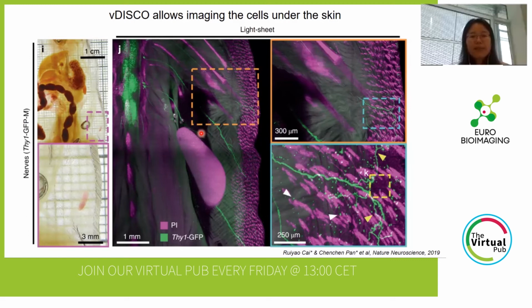When we do whole body imaging through this transparent mouse, we can see the neuron projections coming out from the spinal cord, and under the skin we can see the details of the neuron projections. The green color shows the Thy1-GFP neuron signal, and the magenta color shows the PI-labeled cell nuclei.